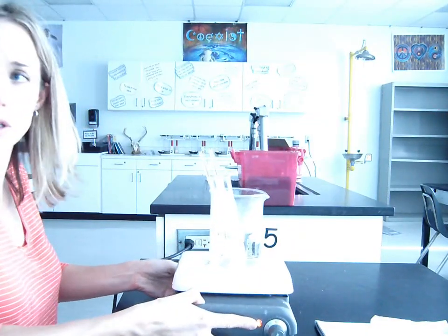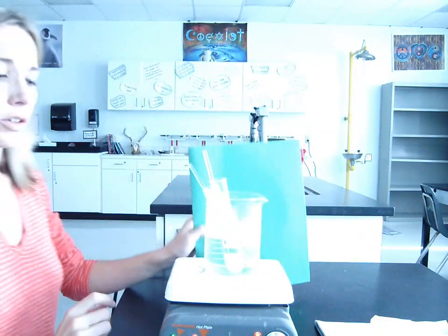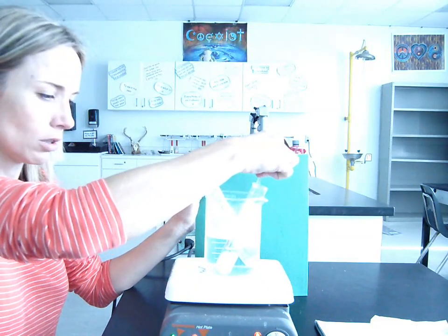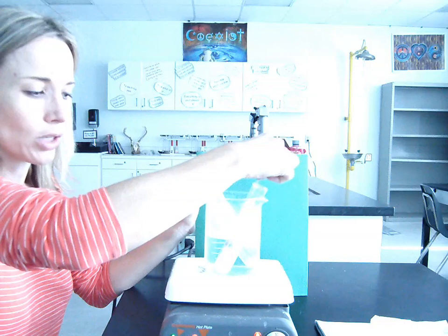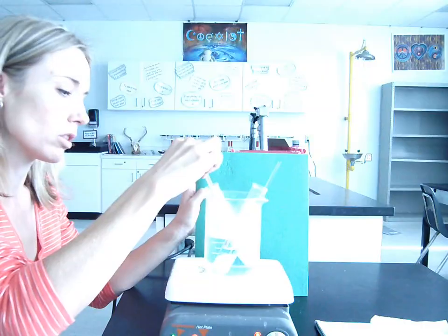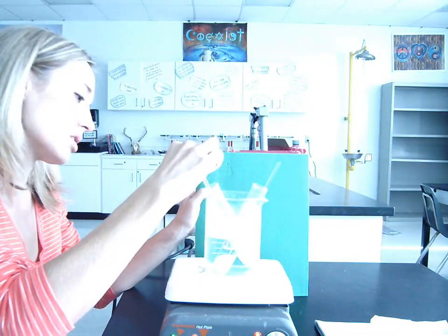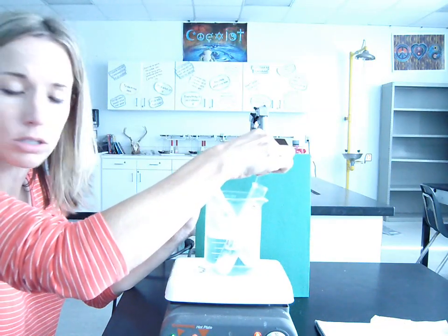So let's see if I can move this over here. I can put this behind it so you can see it a little bit better. Okay, so what we're going to do is mix them, and I'm going to have to mix one at a time. We have glass stirring rods in here, so as you guys know, when we create solutions, it usually helps to kind of mix them a little bit, like we did with Lab 4.1, the blue stuff, we had to mix it up. And same thing with yesterday with Lab 4.3, we had to mix it up to get the stuff to dissolve. So we're going to see if heating it has any effect on the solubility.